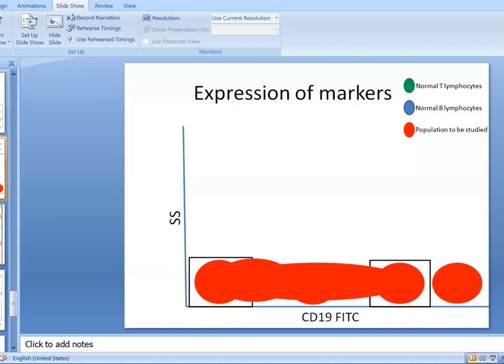So I showed you this. These are plots and tables, where you have a histogram, dot plot, tree plot, radar plot, density, contour, and I showed you what overlay is. Okay. These three I don't commonly use, which are comparison and cell cycle. I don't commonly do cell cycle analysis.